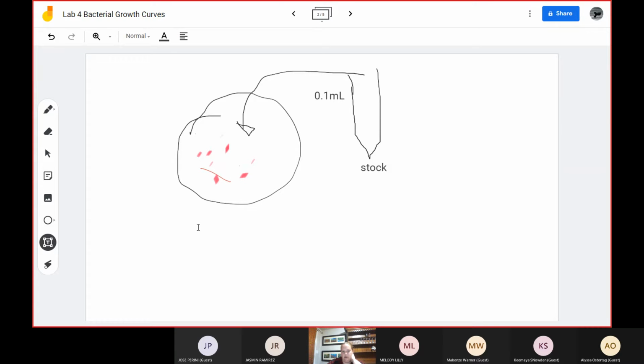So for example, if this is 25 colony forming units, and the amount that you use to plate is 0.1 milliliters, I'm going to break out my phone calculator here. I encourage you guys to do so as well. It would be 25 divided by 0.1, which equals 250.